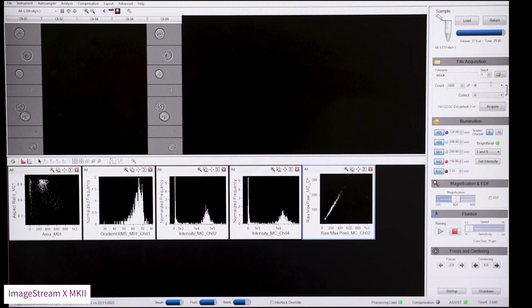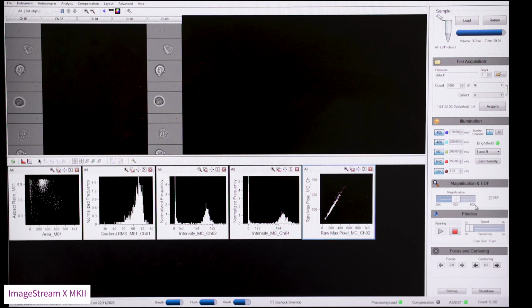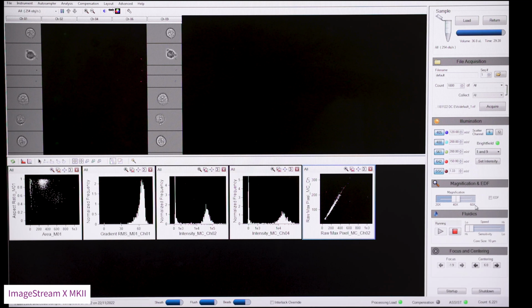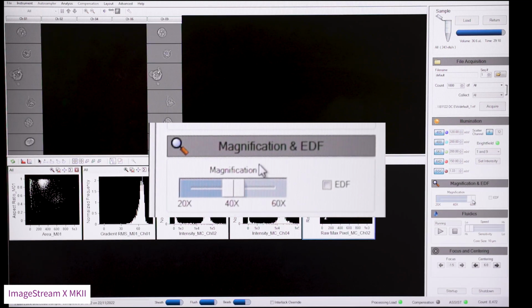The first thing to decide is the level of magnification required. In general, we want the image of the cell to fill the frame. If the cells are large and do not consistently fit within the frame, then reduce the magnification. The pixel size is 0.3 microns with the 60 times objective, 0.5 microns with the 40 times, and 1 micron with the 20 times objective.